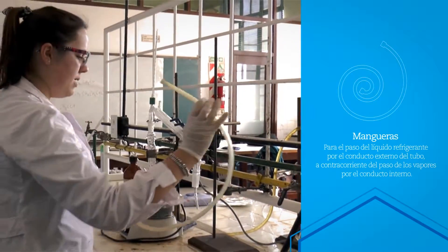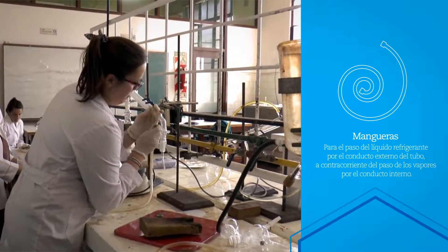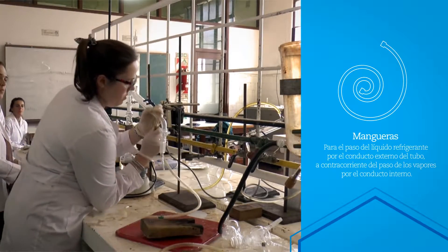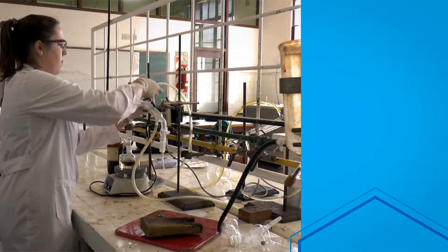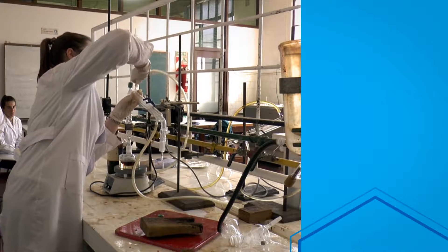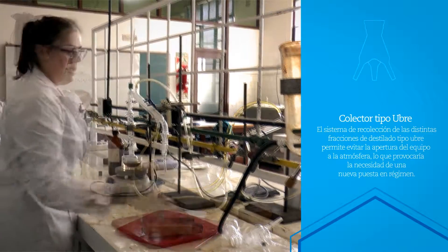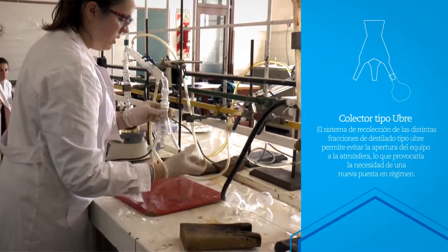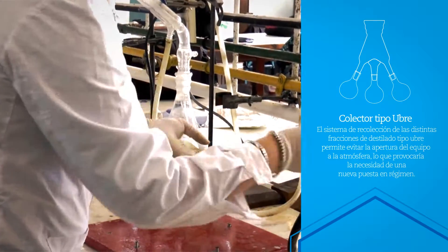De nuevo, refrigerante a ver flujo, así que conectamos la manguera — la entrada de agua por acá abajo, la salida por arriba. Y ahora ponemos el colector de ubre, como ya conocen, cada boca con su baloncito.